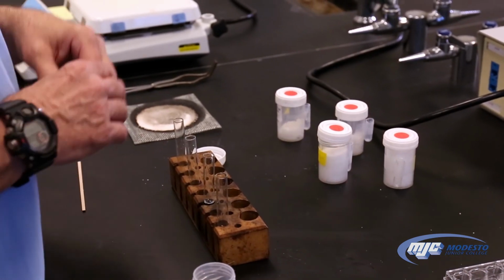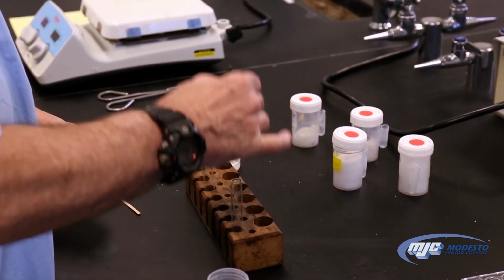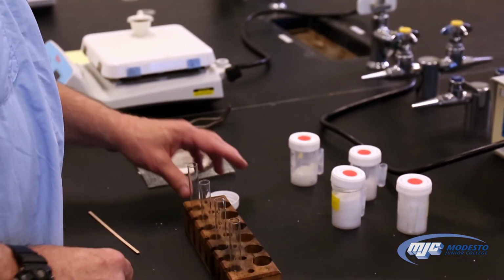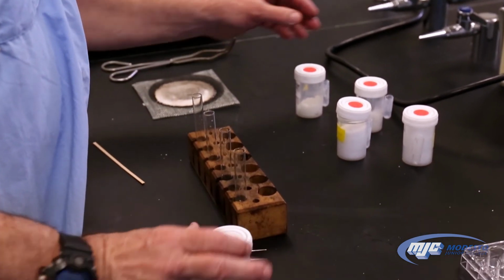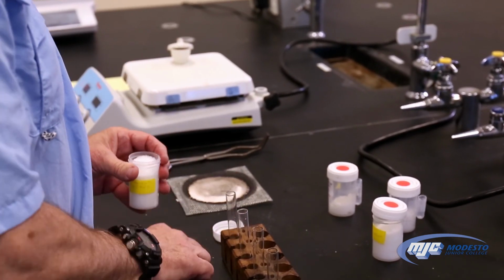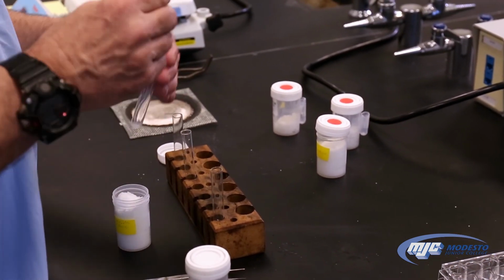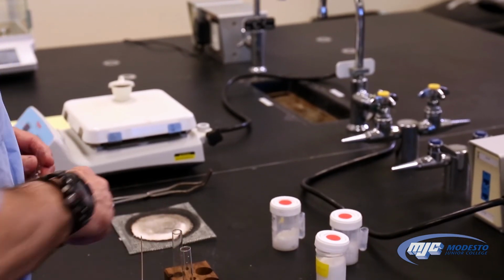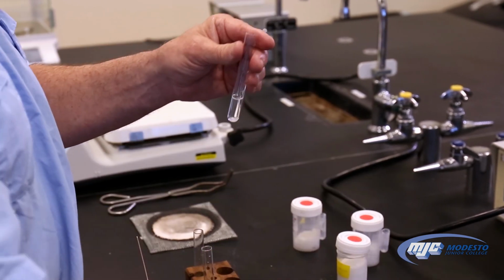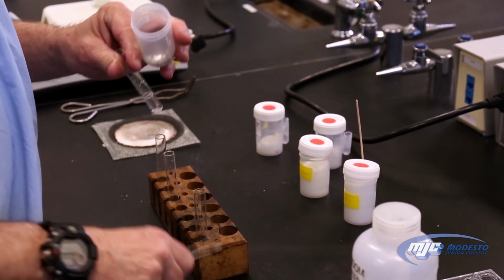Now I'll show you what it looks like if you don't have zinc sulfate and you have magnesium, because that would mean you have magnesium sulfate. So we take our unknown, put a little bit in the test tube. Again, that's more than enough. It's wet in there already. Add a little bit of DI water. Give it a little flick, help it dissolve. And put the piece of magnesium in.